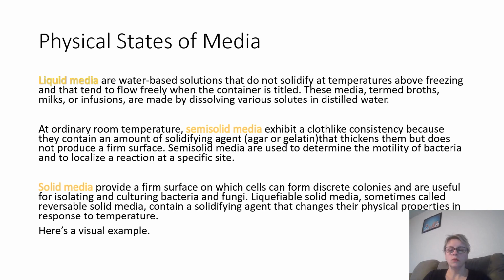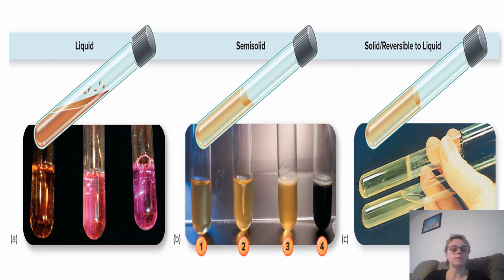Here is a visual example of liquid media, semi-solid media, and solid media. The first column is the liquid. You can see as you tilt it, it moves. The semi-solid is the second column. The third column is the solid, reversible to liquid.